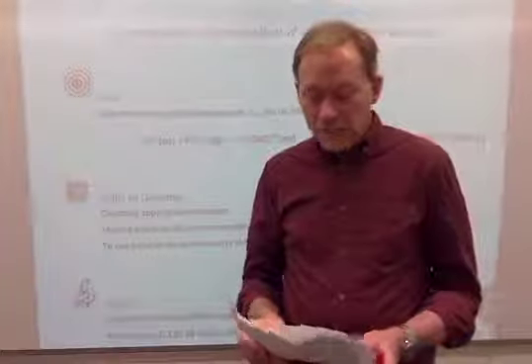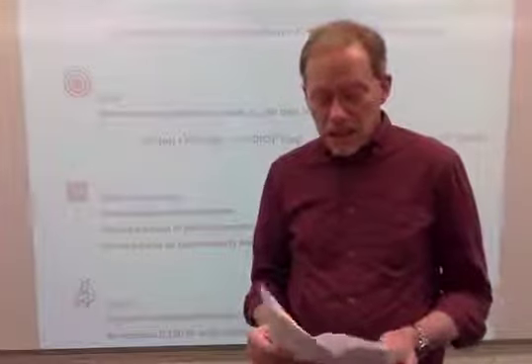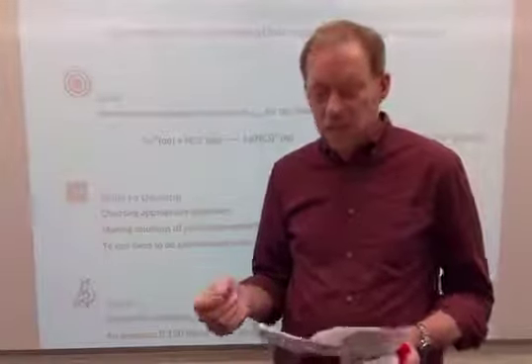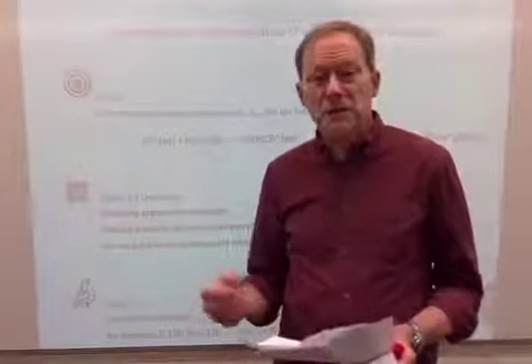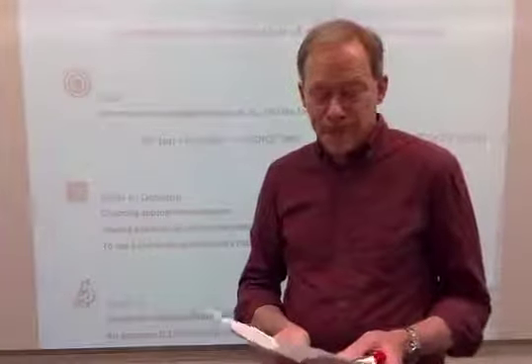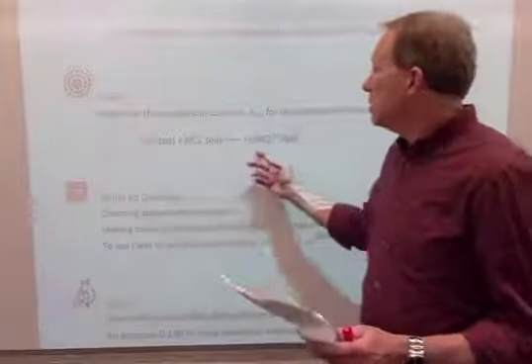So, what we're going to do in our lab activity today is support the concept of chemical equilibrium that you're getting in the classroom. And we're going to do it through lab measurements so you can put a different approach to understanding these concepts. So we've chosen an equilibrium that's represented here on the board.